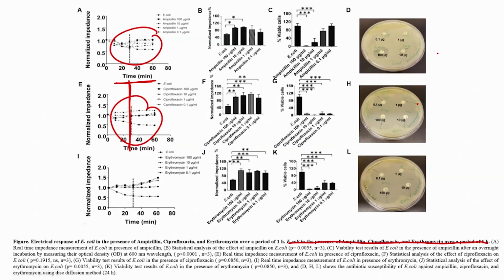The idea is that now we can rapidly diagnose, we can rapidly capture the bacteria, and we can understand whether the bacteria is resistant to antibiotic or not.